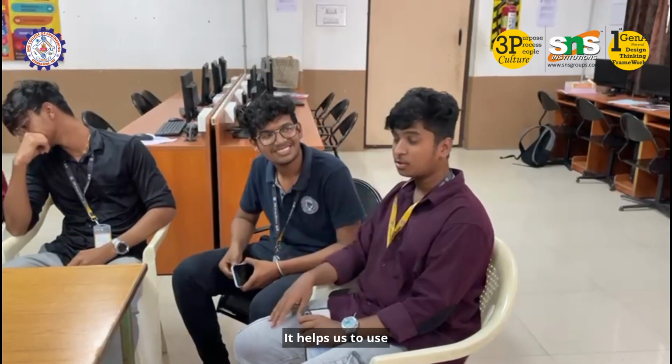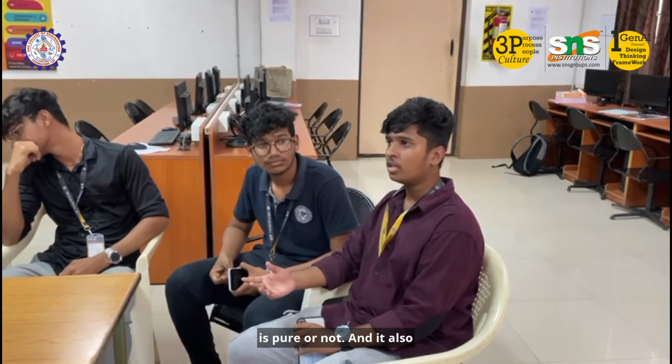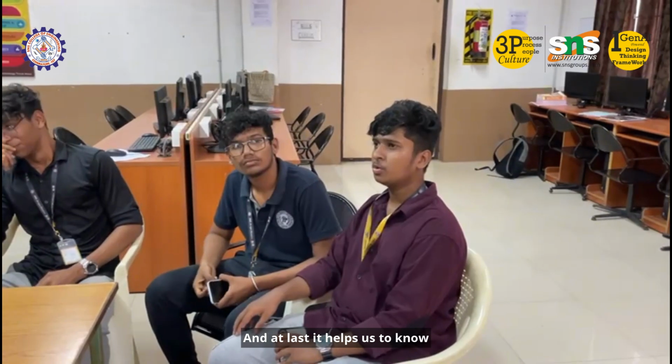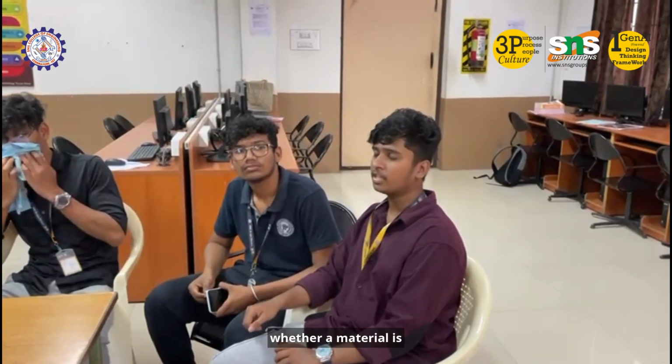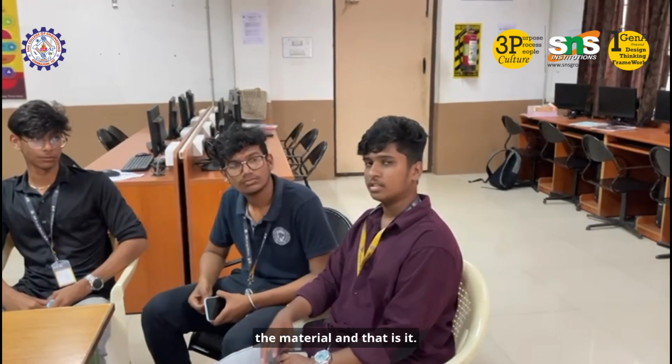It helps us know what materials are made up of, whether they are pure or not, and it also helps in industries like medicine, forensics and agriculture. At last, it helps us know the structure and chemical bonds in the material, and that's it.